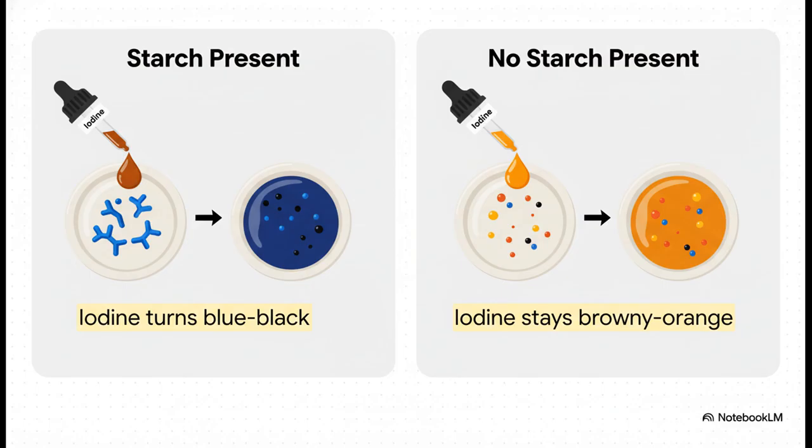The moment all the starch has been broken down, there's nothing left to react, so the iodine just stays browny orange. That's our finish line. That's the time you write down.